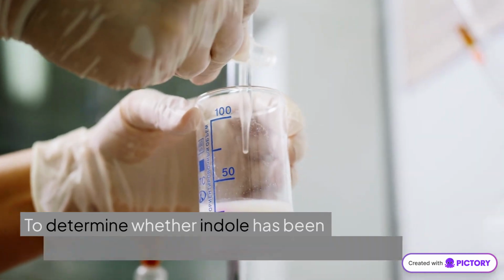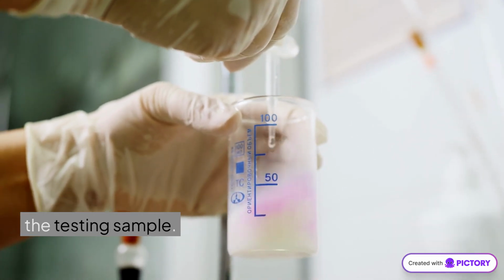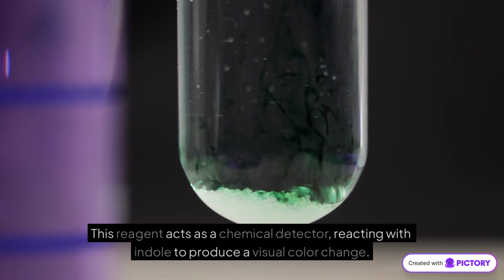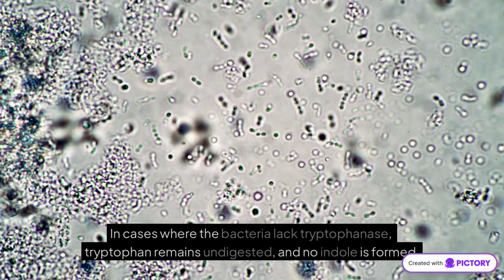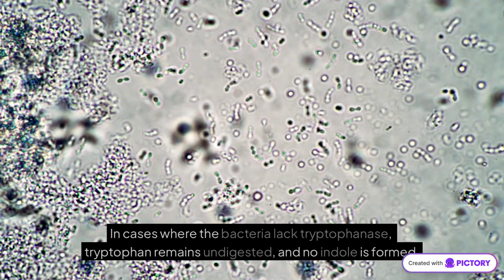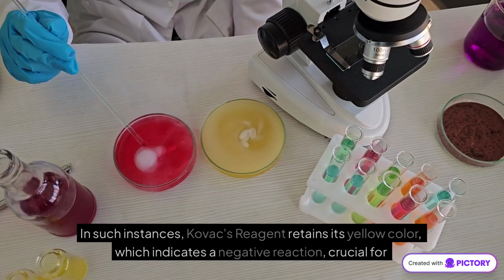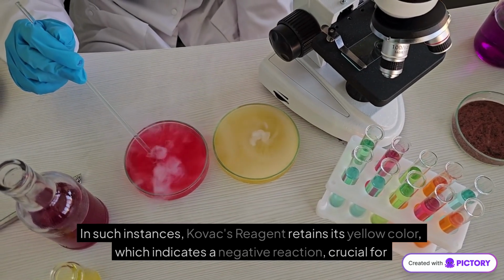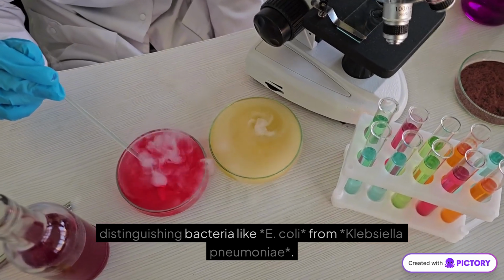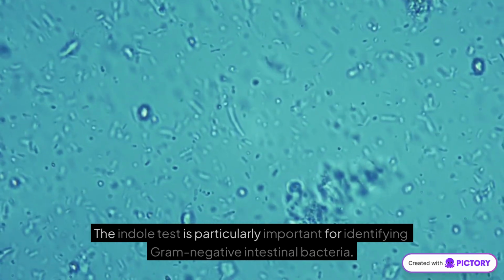To determine whether indole has been produced, Kovac's reagent is introduced to the testing sample. This reagent acts as a chemical detector, reacting with indole to produce a visual color change. In cases where the bacteria lack tryptophanase, tryptophan remains undigested, and no indole is formed. In such instances, Kovac's reagent retains its yellow color, which indicates a negative reaction, crucial for distinguishing bacteria like E. coli from Klebsiella pneumoniae. The indole test is particularly important for identifying gram-negative intestinal bacteria.